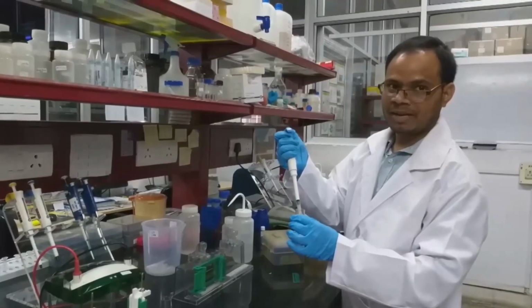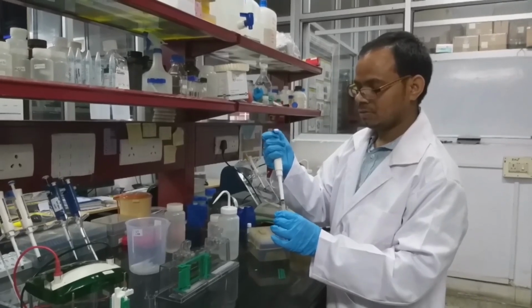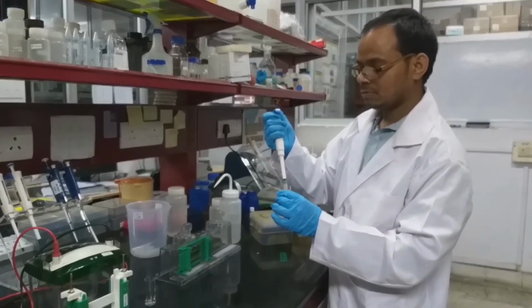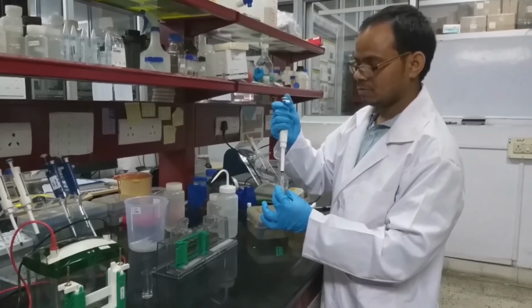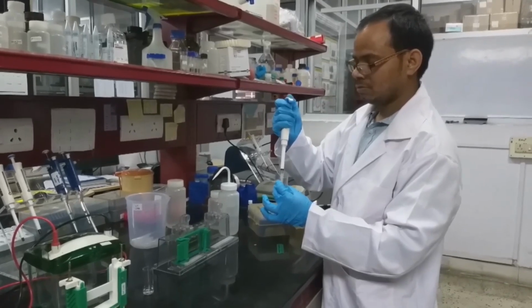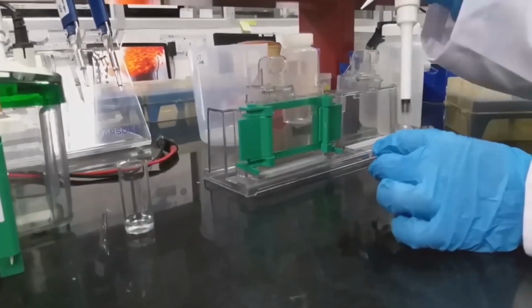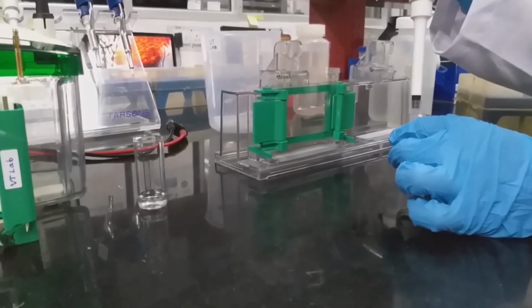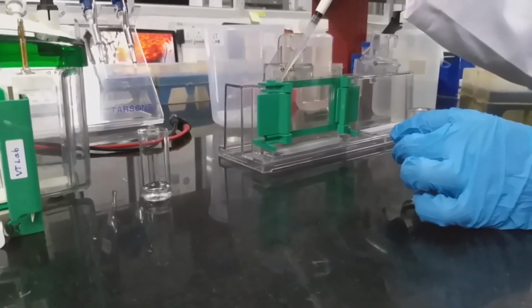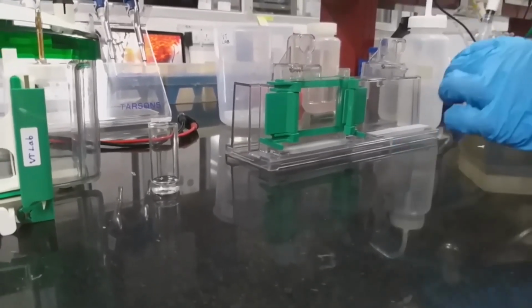We have to mix properly after adding the TEMED. Then you just add at one corner. Next we will keep it calm.